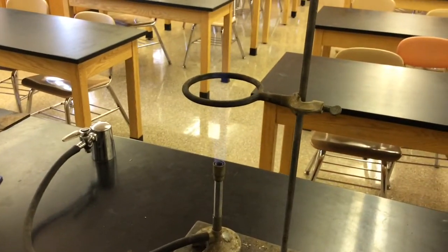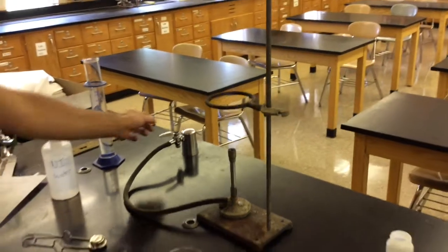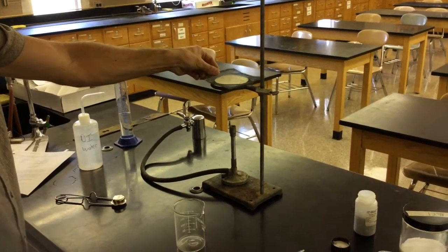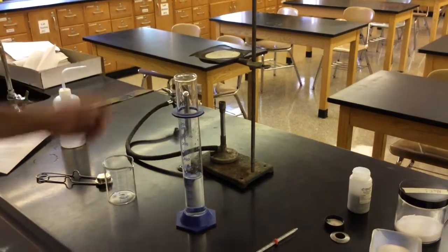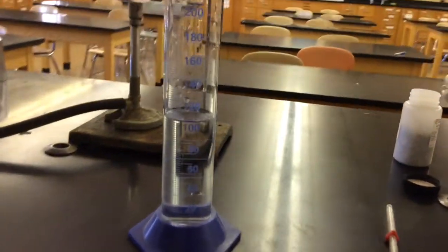You don't want it too far down and you don't want it too far up, because then your material will never boil. So this to me looks pretty good. So I'm going to turn that off now. Put the wire gauze on top because we will need that. And we're going to use a graduated cylinder to get 150 milliliters. Now I already have some water in there, but we're using DI water.